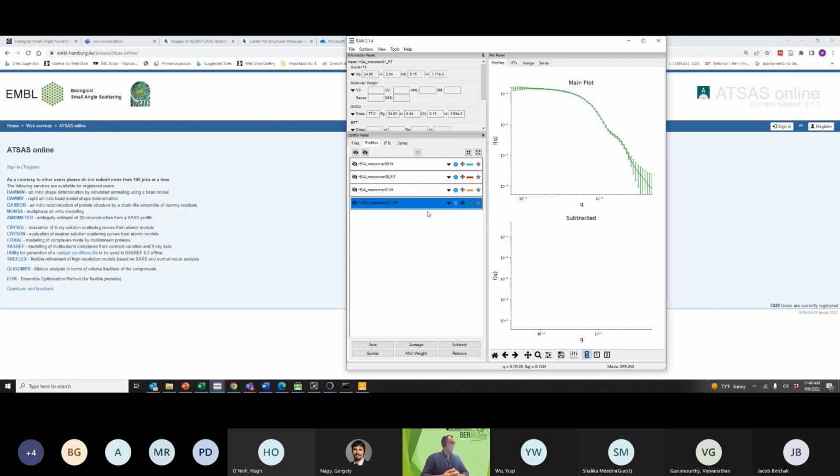That was my initial idea, and that is mostly what we need to do during some more sophisticated analysis. Molecular dynamics simulations and other types of modeling of the structures demand much more time and depend on the system you are working with. But if you need help with that analysis, please reach out to us. We are more than happy to guide you and say what direction you need to go, based on what we know of the system, which is also very important.